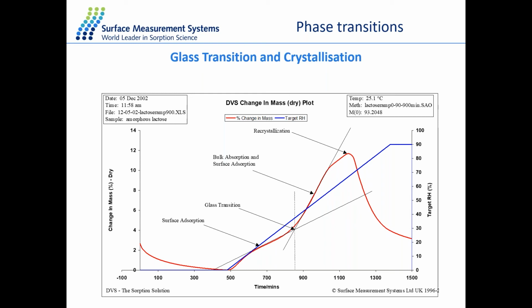If you picture an amorphous sample, the structure of the molecule is very disordered, which means that there is a lot of space for molecular water to pile into the structure. When you move to a crystalline phase, the molecules repack into a crystalline form. And what that causes is that the water molecules cannot occupy the same space. They need to be released from the structure.